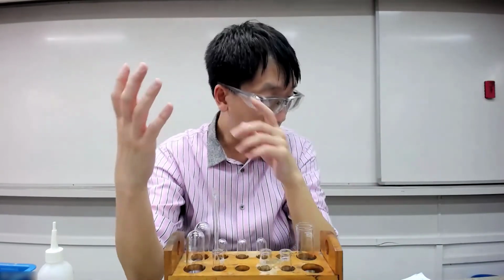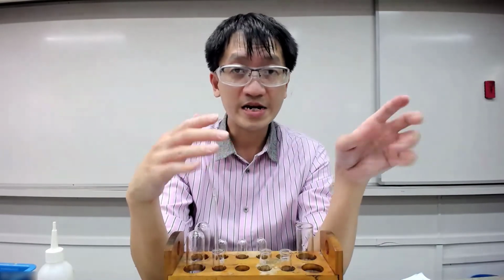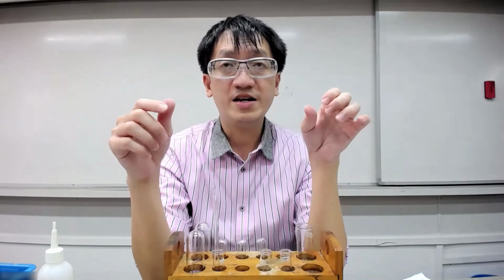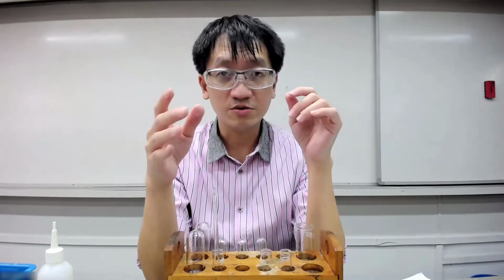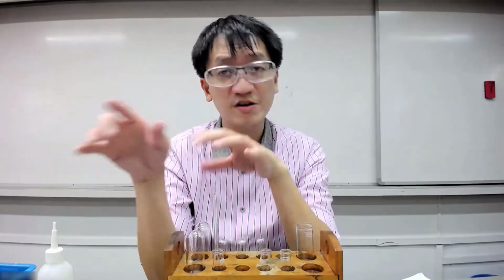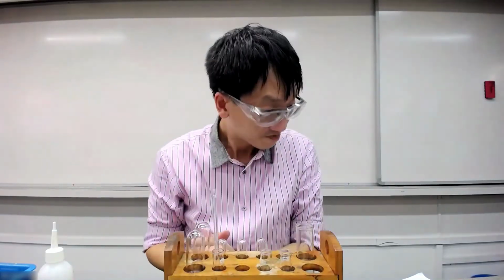That's the reason why we ask you to let the PPT settle down, decant the solution away, wash the PPT with deionized water, then remove the water, and then add aqueous ammonia, because then we'll be able to very clearly see if the white PPT can dissolve in aqueous ammonia or it can't dissolve. So that's the way experiments are conducted.